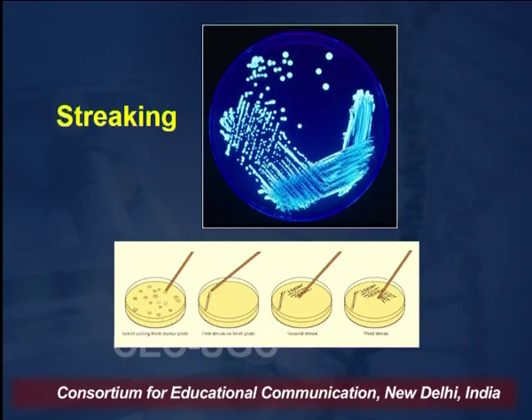Now, let us consider different methods of streaking. Because we are studying microbiology, we need to culture the microorganism, and for culturing the microorganism, there are different ways. Streaking is one of the ways of culturing the microorganism on solid agar plates.